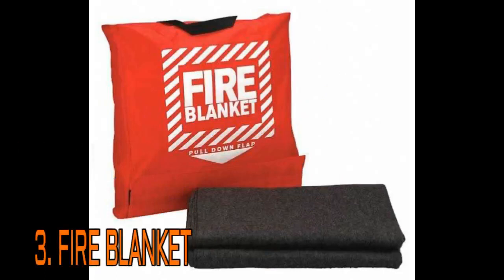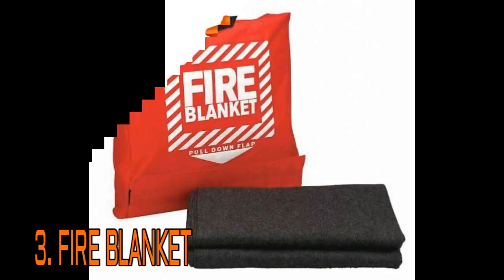Number three is the fire blanket. This is stored inside a labeled red box attached to the wall next to the fire extinguisher. The blanket is to be used on clothing that catches on fire. The blanket can also be used to cover a shock victim in the lab.